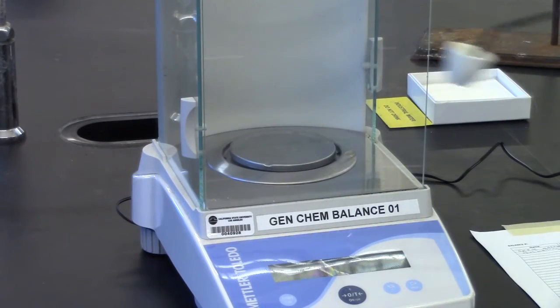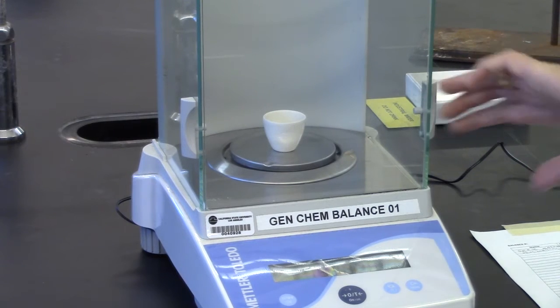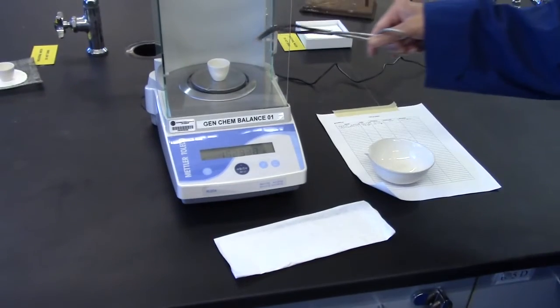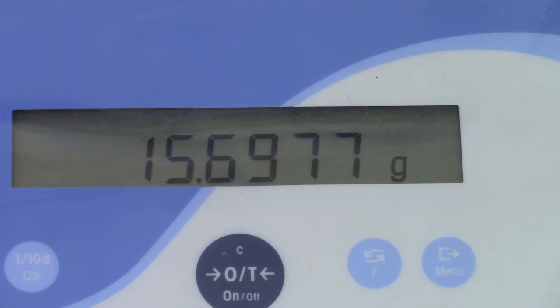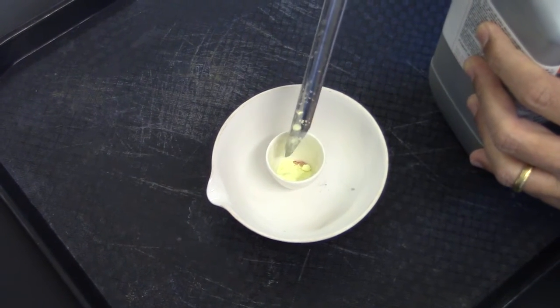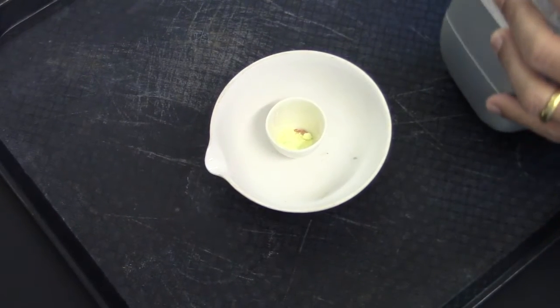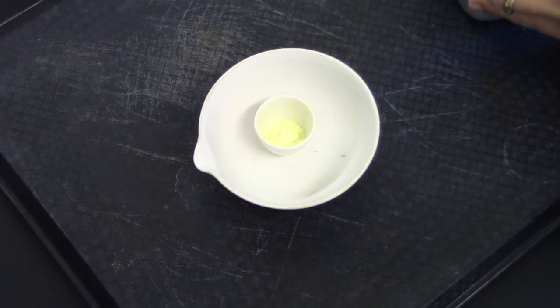When the crucible has cooled, weigh the empty crucible to the nearest 0.0001 grams on the analytical balance. Next, add copper wire to the crucible and weigh again to the nearest 0.0001 gram. Fill the crucible halfway to cover the copper with sulfur powder. Excess sulfur is added to be certain that all copper reacts.